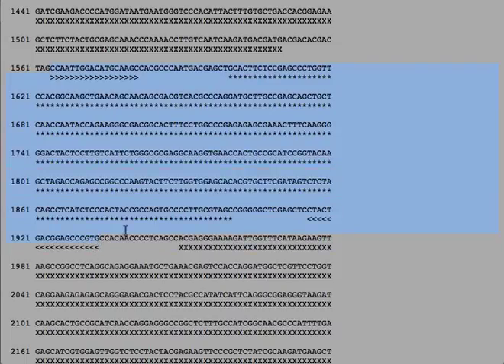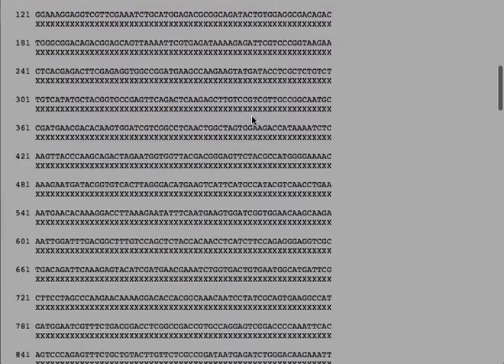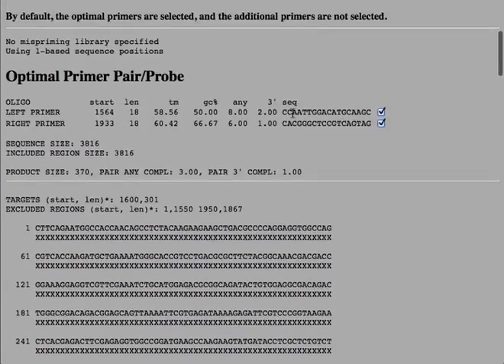We amplified that DNA using the primers, which are shown with the symbols underneath here. There's the left primer, and then here on the bottom is the right primer. Okay, now what we need to do is take these primers and use them to clone this piece into the proper plasmid. To do that, let's come back up to the top here and look at the primers.